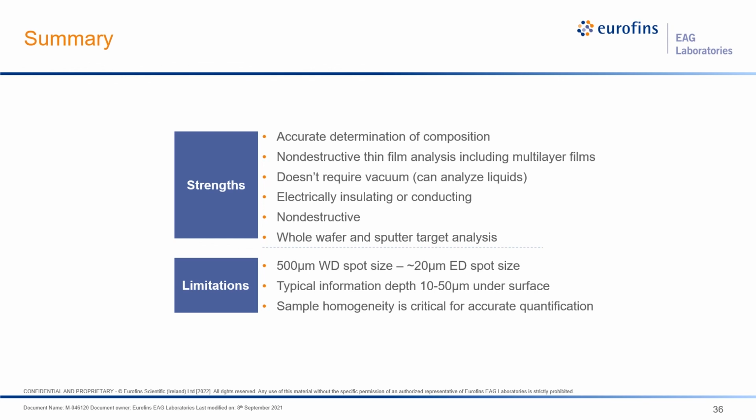There are materials that will degrade under high-power X-ray bombardment. With the appropriate instrumentation, we can measure large samples, as I've shown, both full wafers for thin film mapping and large samples for non-destructive compositional measurements. Regarding limitations, I've listed the spot size as one. The sensitivity of WD-XRF varies significantly with spot size. And while we can go down to 500 microns spot size with our tools, the sensitivity at this spot size for trace element analysis is limited.